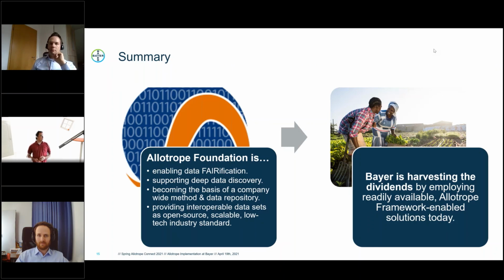I think when it comes to LIMS, we are still more in a mapping space, because I think there's a technology gap between the ontology that's usually used in the ADF and how LIMS master data and metadata sets are structured. So this is more of a low-level mapping exercise, but this is how we try to leverage the structuring of the information. Eric, if there are things to add.